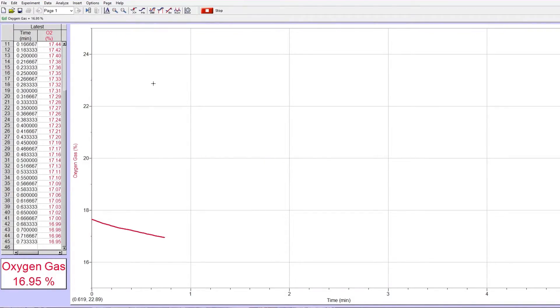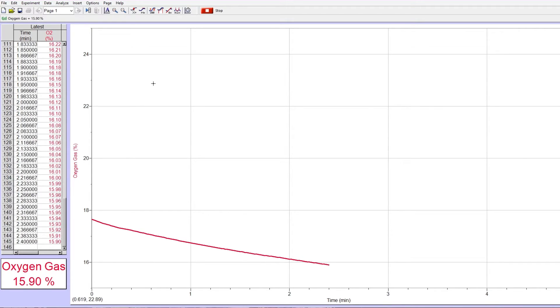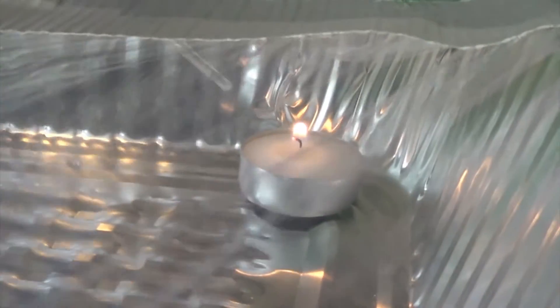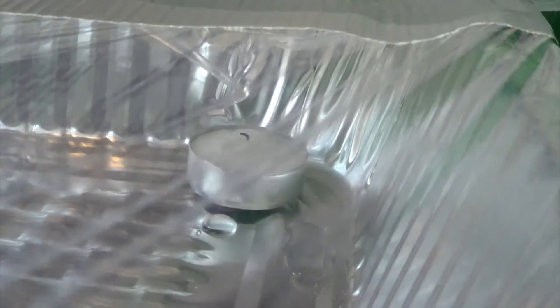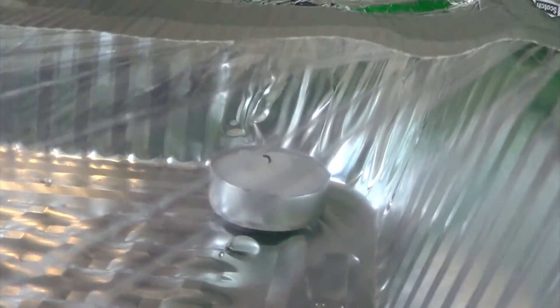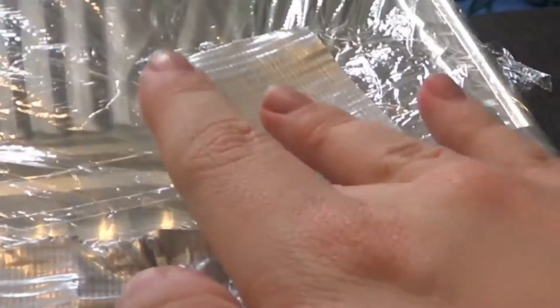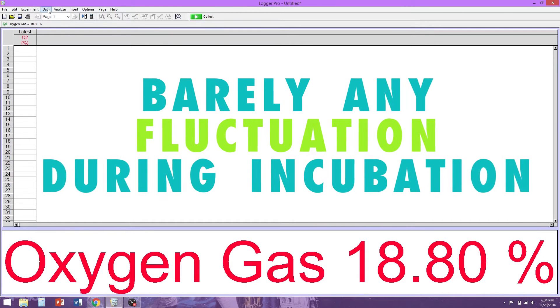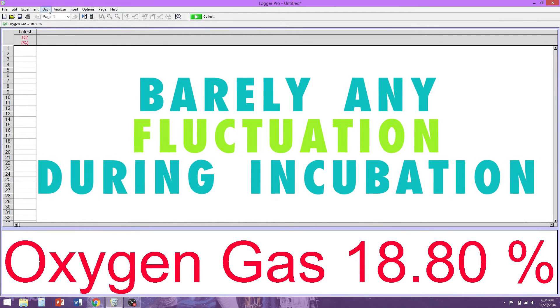Watch as your O2 sensor begins to show a very gradual decrease in oxygen concentration. At this point, it's just a matter of waiting for the oxygen concentration to drop to your desired level, and then you can put out your candle simply by pushing the pipette directly above the candle's flame and adding a few drops of water. With the candle's flame put out, quickly remove the pipette and seal down the opening with a piece of tape. Assuming that you sealed everything down nicely, your oxygen concentration should remain stable with barely any fluctuation. And there you have it — a simple, low-cost, reusable method to induce hypoxia for physical and life sciences experiments.